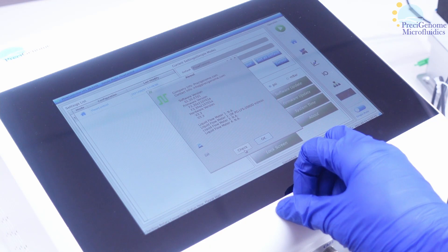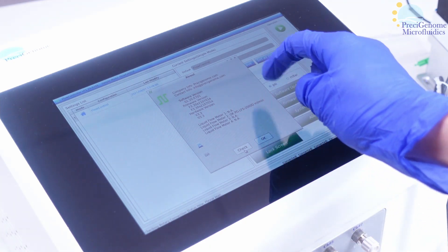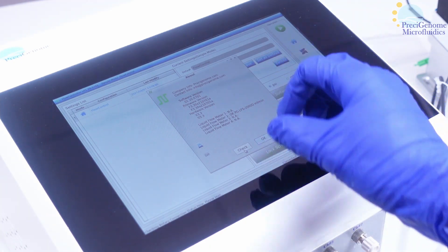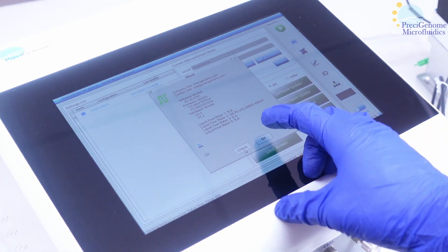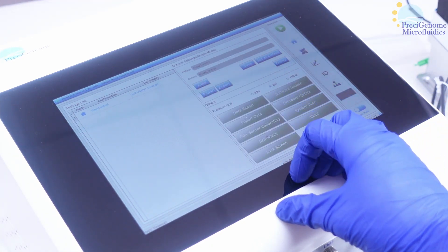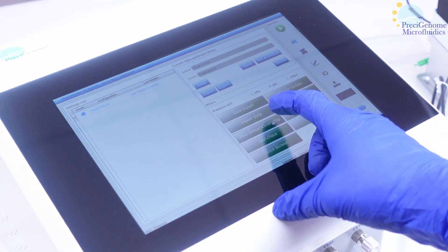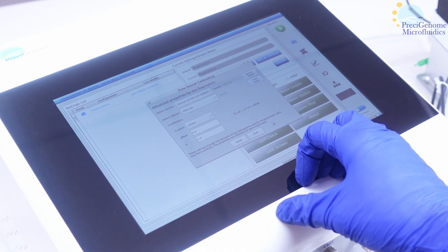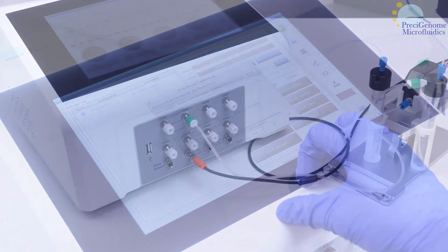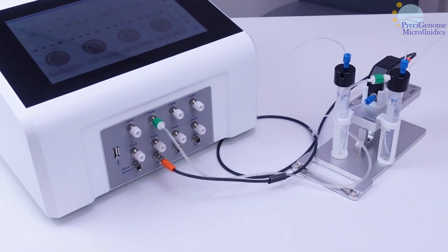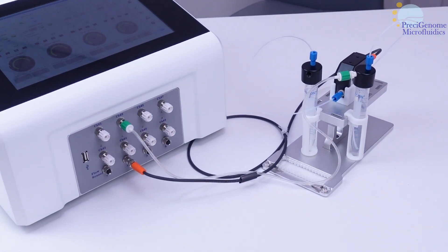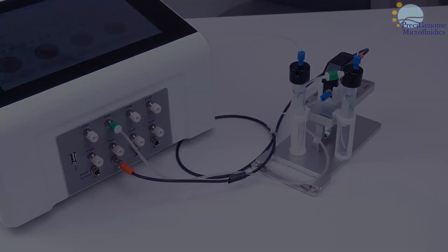In this video, we will look at how to calibrate a PreciGenome flow sensor to non-standard fluids. For how to integrate a flow sensor into your setup, please consult the previous video.